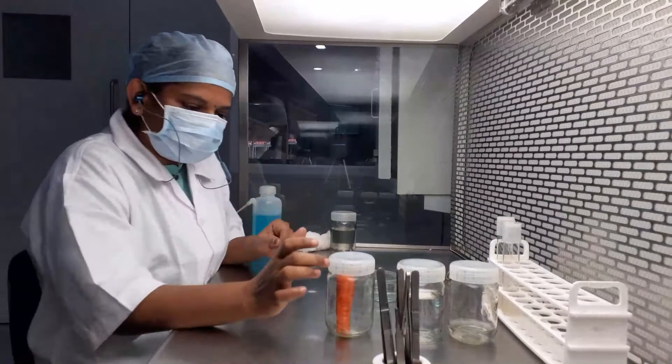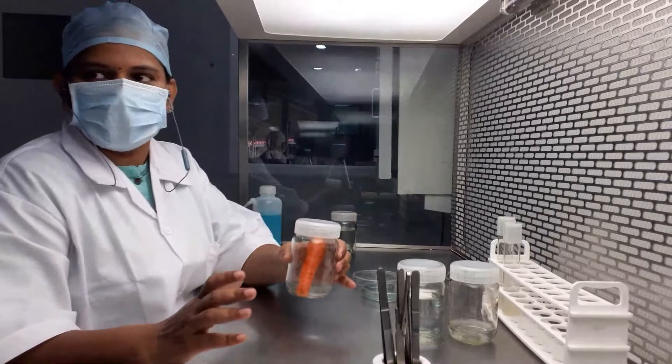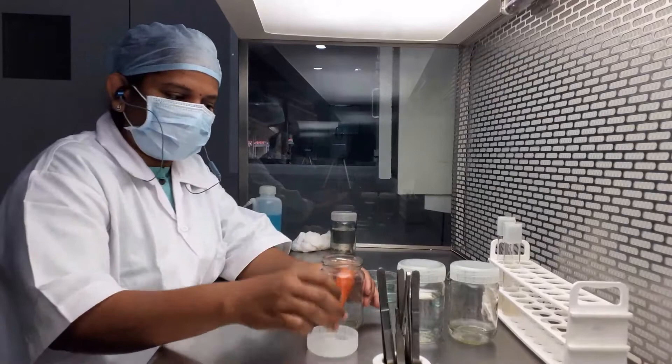We have done the first part of surface sterilization with tap water and detergent in the media preparation room. Now we are in the laminar air flow room, the inoculation room, where we will be carrying out the next surface sterilization of our carrot.